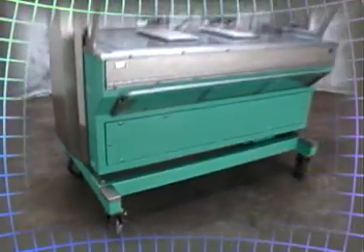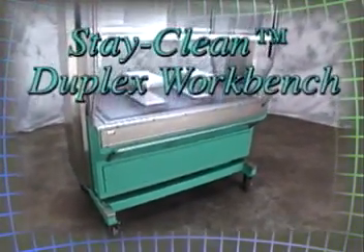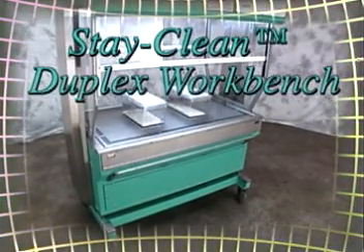The Stay Clean Duplex workbench — providing the right solutions and the right environment for researchers and the animals they care for.